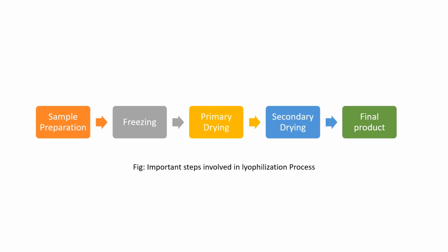Before starting the actual process of lyophilization, we need to know all the physical, chemical, and microbiological product characteristics and properties of the drug.